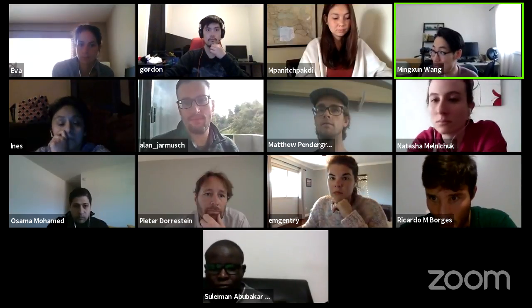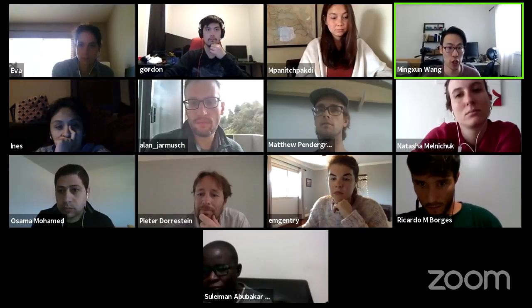Hello, Ming, where can I find it? I was searching for it, but I didn't find it on the GNPS webpage. Yes, so let me link it to you here. It's already embedded in all of these analysis links, but it's not advertised as a standalone tool. But I just posted it in the chat.